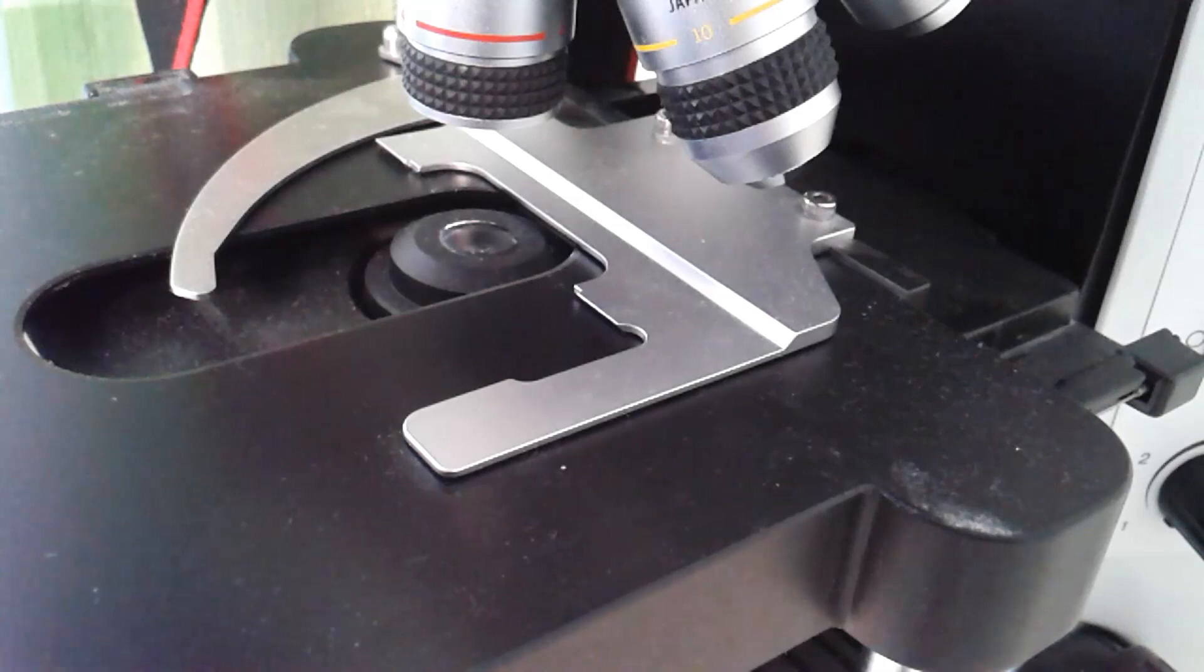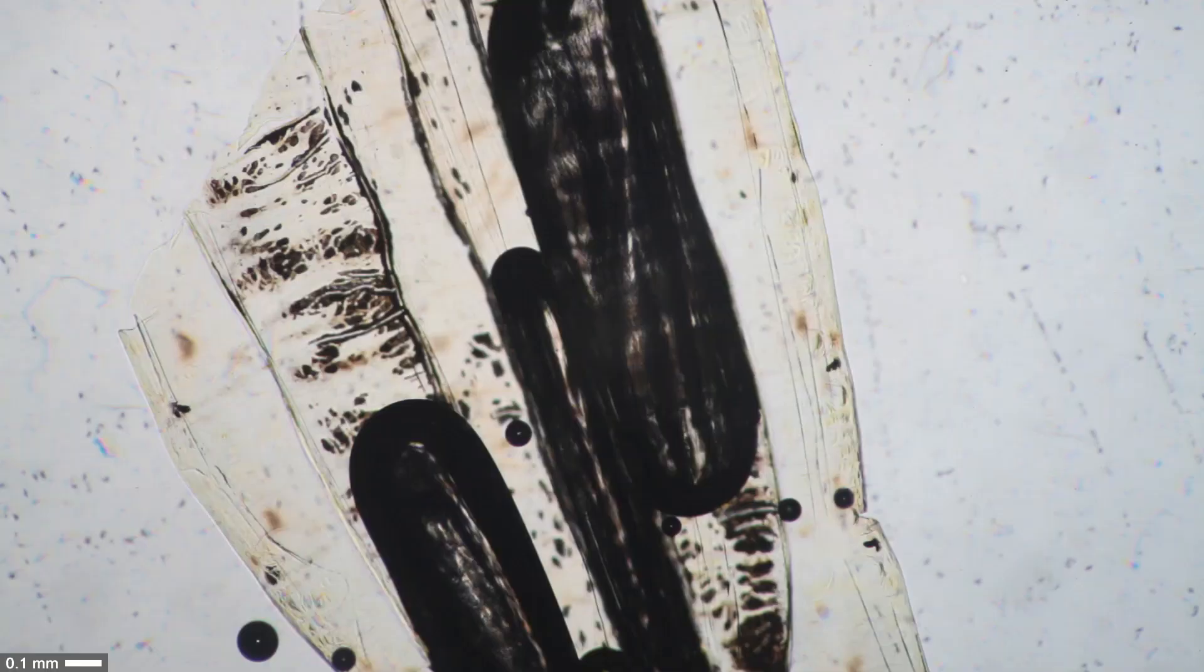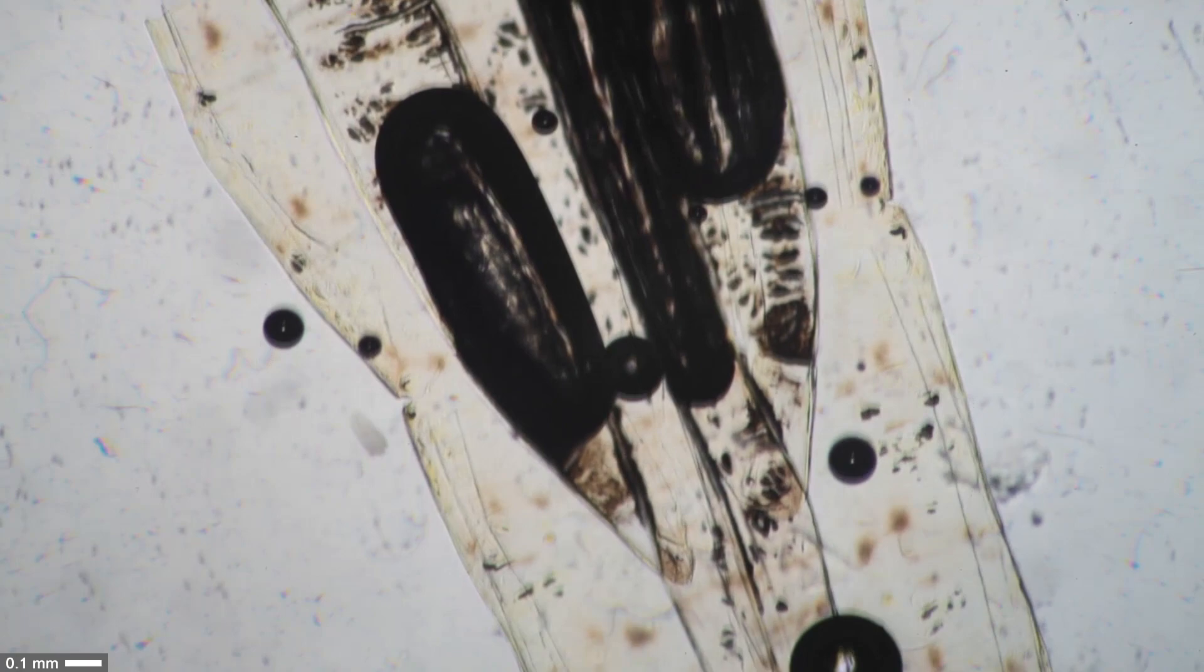I'm going to show you how this looks like using Euparal. The black oval things, these are air bubbles. That's basically very transparent, as you can see. The large black circles are also air bubbles. Very transparent, and you can see there's some discolorations and pigments there as well.